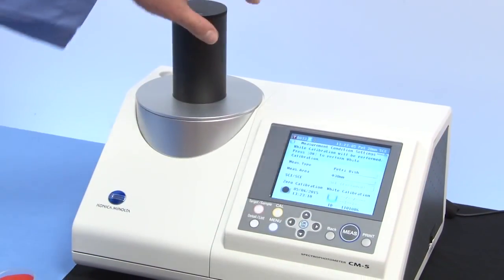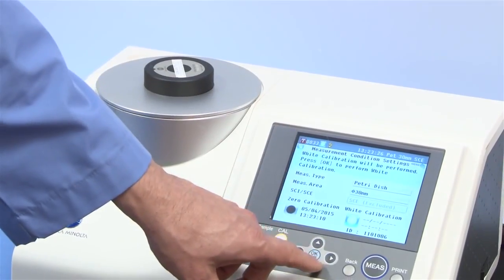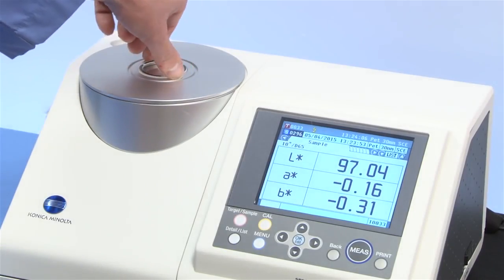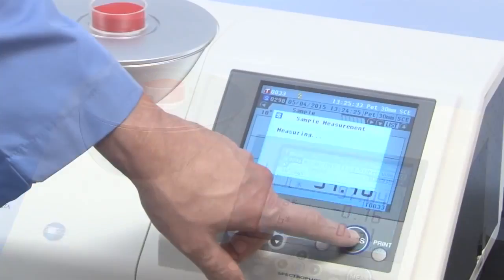Perform zero calibration and then an external white calibration through the glass piece. This will normalize the instrument when measuring samples through a petri dish. Proceed to measure your targets and samples in reflectance mode as normal.